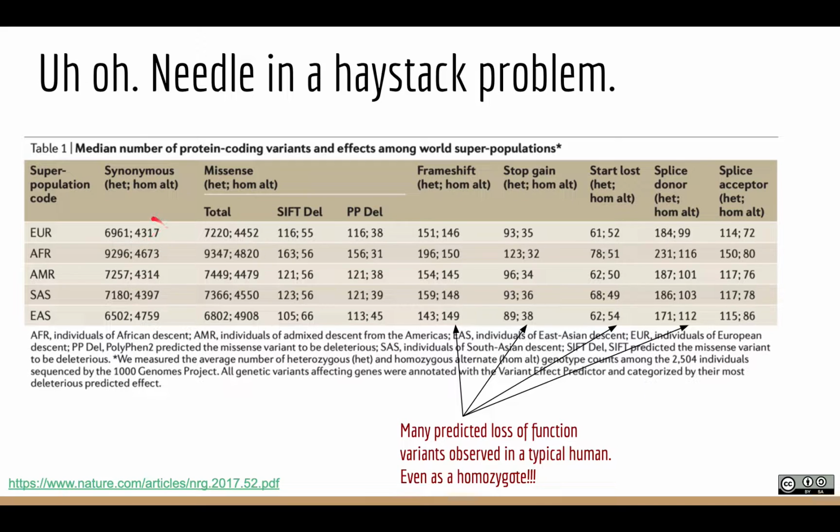So in the case of a rare disease study, we probably wouldn't be too interested in synonymous changes anyway, because they don't alter the amino acid sequence. So given the severity of the phenotype, we might say, well, that's probably not terribly interesting. There are definitely exceptions to that rule, though.